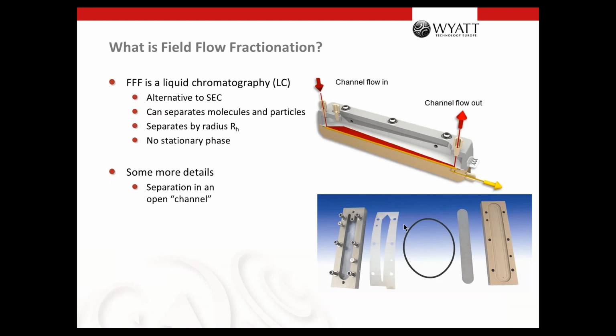Then we have the spacer. The spacer is a foil which forms the separation channel. And on this foil we put the upper lid, and in the upper lid we have here a Makrolon inlay so that it is possible to look through. And with that you can see air bubbles, for example, or you can even see the separation of colored samples.